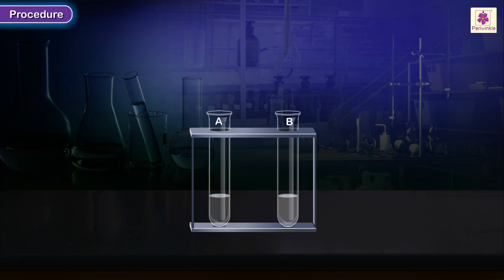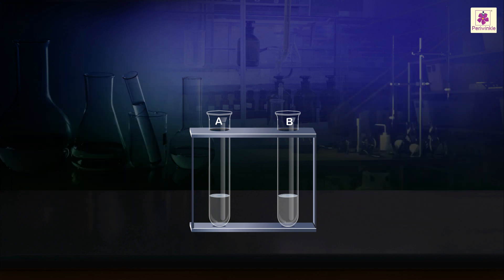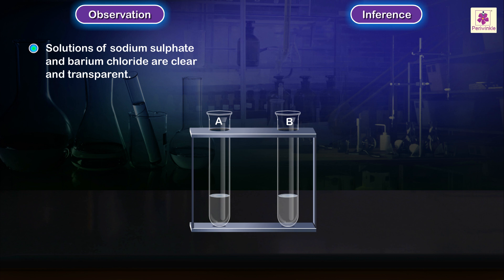Place the test tubes in the test tube stand and observe the color of the solutions. Observation and inference: Solutions of sodium sulfate and barium chloride are clear and transparent. Both solutions are colorless and transparent.